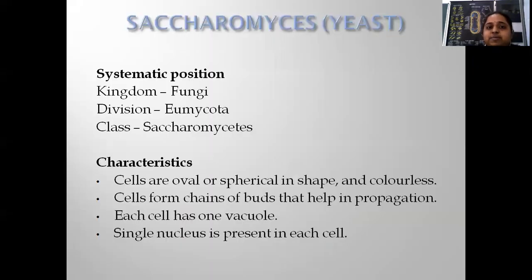Coming to the next specimen, Saccharomyces, which is called yeast. You have come across the term yeast in your day-to-day life also, because yeast is commonly used in preparation of bakery products. In preparation of bread, yeast is used. Yeast is a fungus.